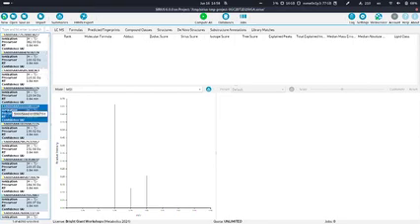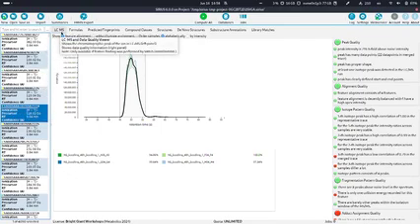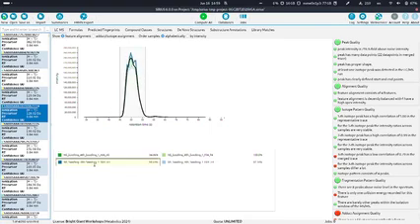This green circle, for example, corresponds to the LCMS tab. You just click on LCMS and you will have this if you just import data, so you don't have to do any computations to see this tab. And there you can look at the peak shape and everything. What you will also have at the bottom are the files which we just imported. And if you hover over it, you will see the actual peak or the actual trace which corresponds to this specific file, which I'm highlighting now.